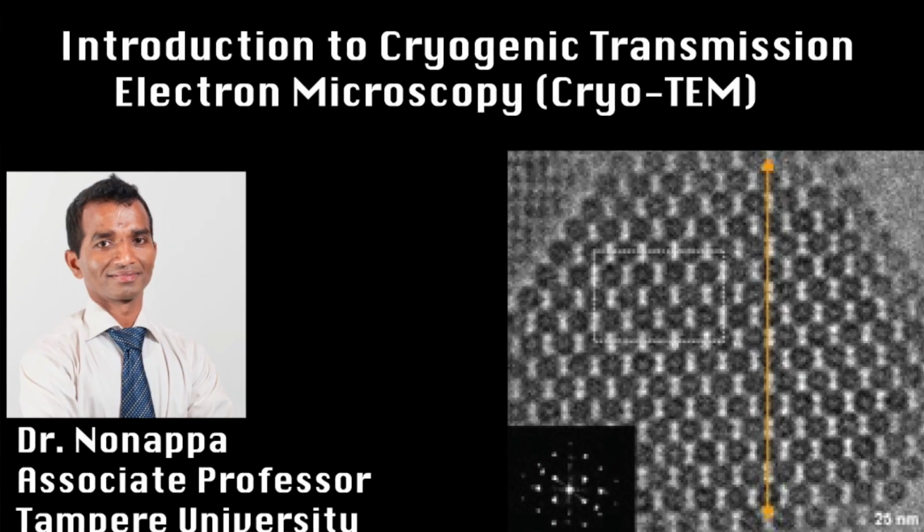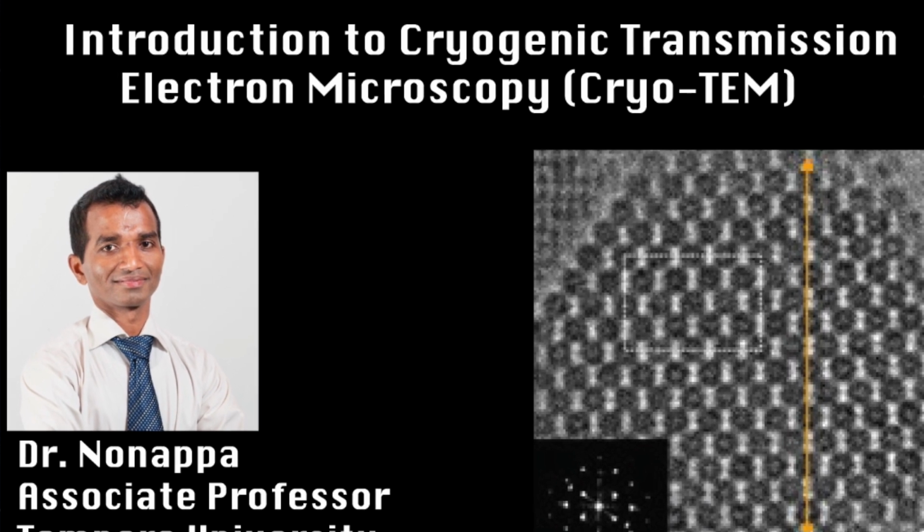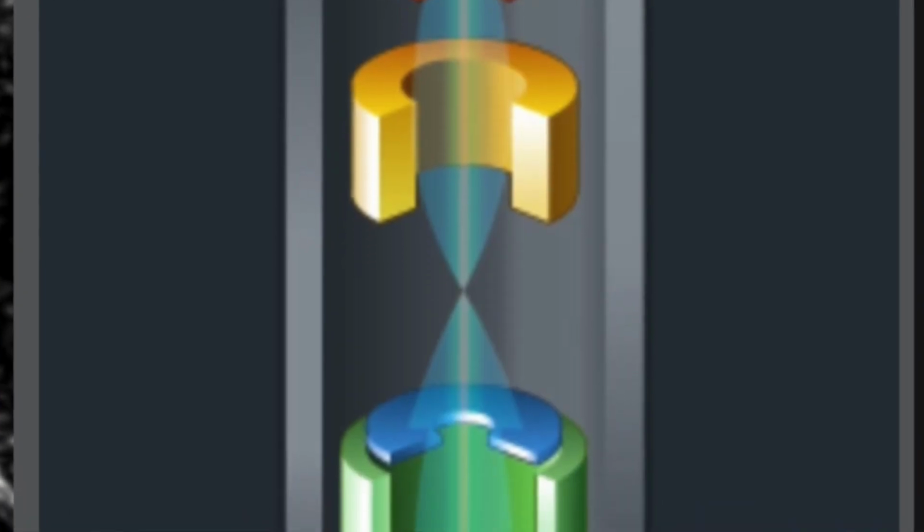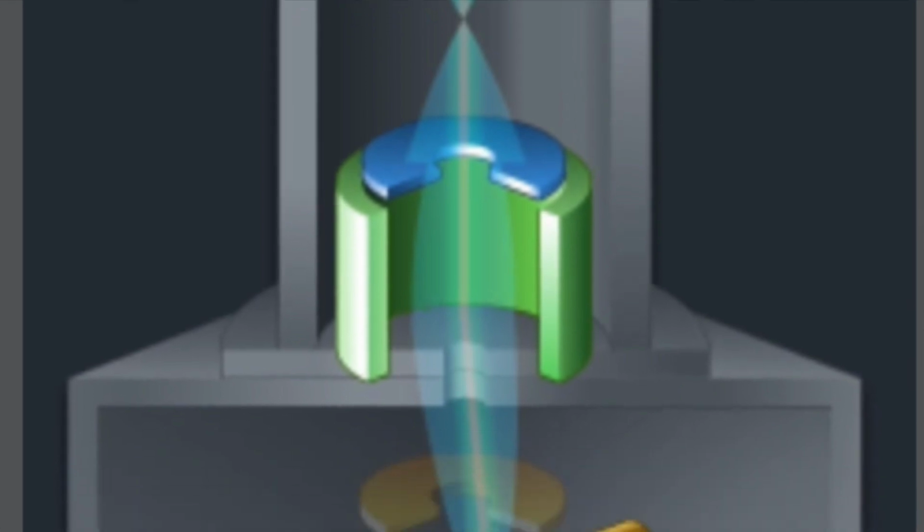In my previous lectures, I have discussed cryogenic transmission electron microscopy and electron tomography. Today, we are going to look into an open source tool called a virtual scanning electron microscopy simulator.